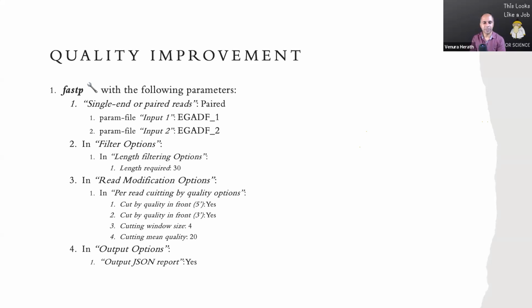Meanwhile, any other questions? Okay, so if you see some black file with some code, that's the JSON file. What you need to look at is the HTML file. It's more human readable than the JSON file.